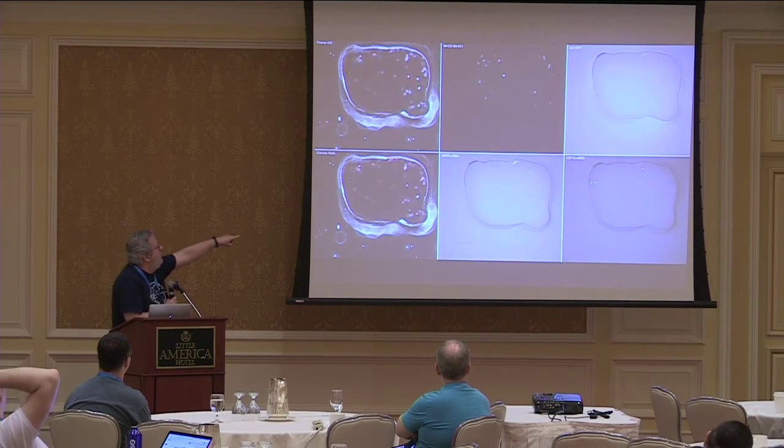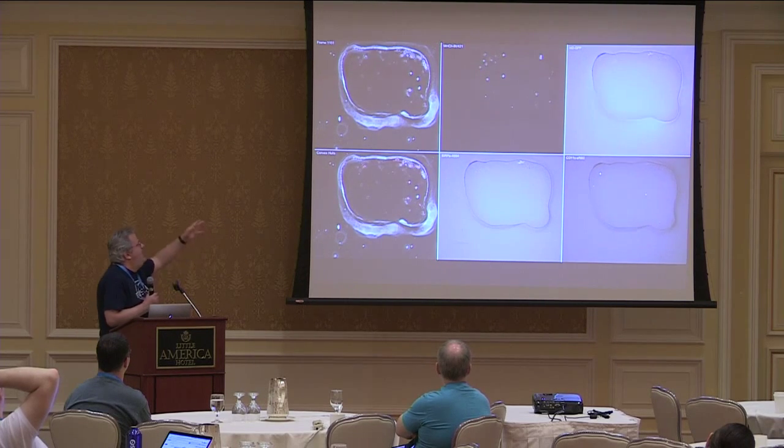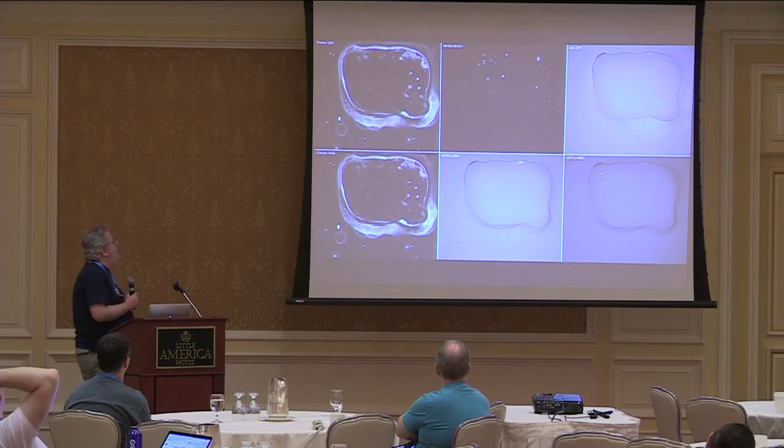The fluorescent things look a little weird because they're only updating every 30 frames. You can also see that the contrast is really odd. That happens a lot. I don't understand why some of the fluorescent frames have different contrasts than other ones.